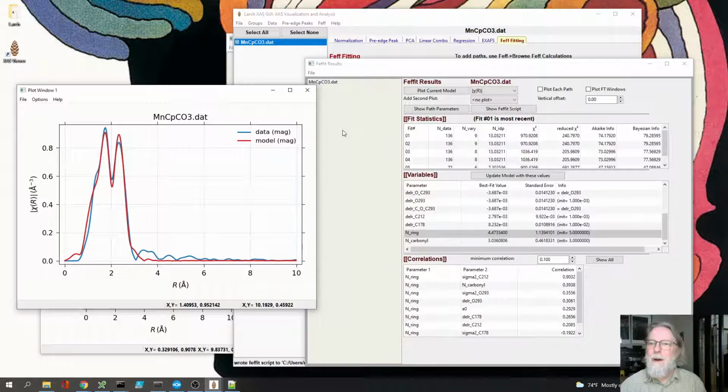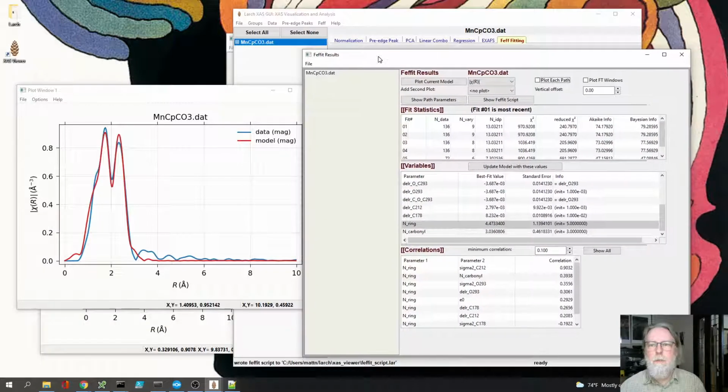So I hope that scares you a little bit for doing any analysis on truly unknown systems, especially truly unknown systems that have organic bonds in them, but that also it gives you some confidence of how you can approach dealing with those kinds of systems, those kinds of spectra, and that this XAFS analysis can be done even on rather complicated systems.